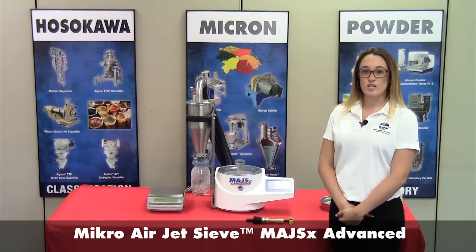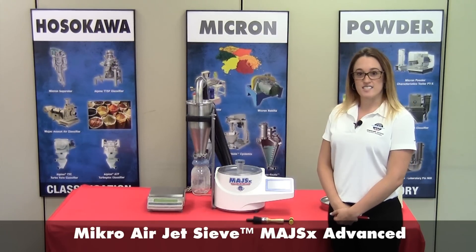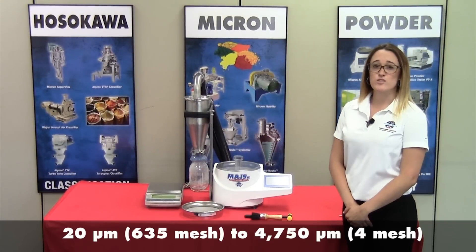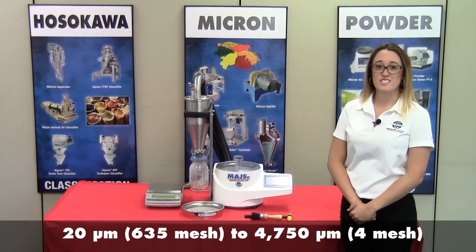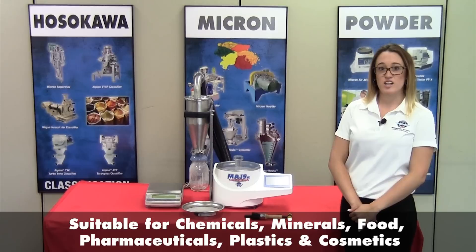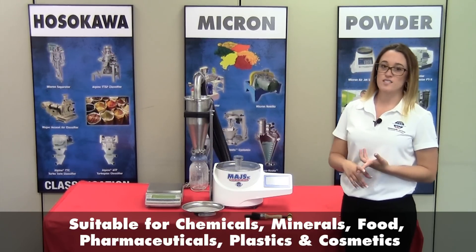Today, we'll be talking about the Micro Airjet Sieve MAJS-X in the Advanced Mode. The Micro Airjet Sieve is used to determine particle sizes ranging from 20 microns to 4,750 microns. It's used in application areas such as pharmaceutical, chemical, mineral, cosmetic, and food.